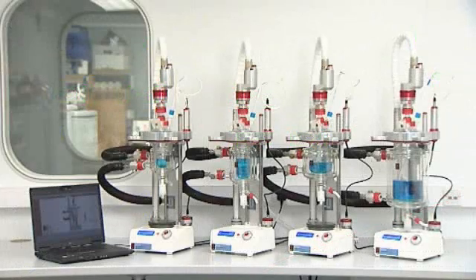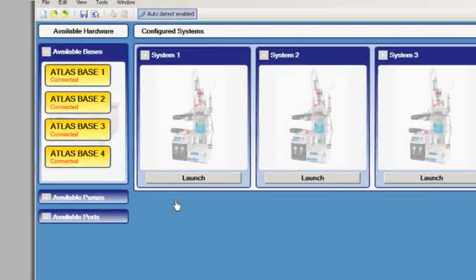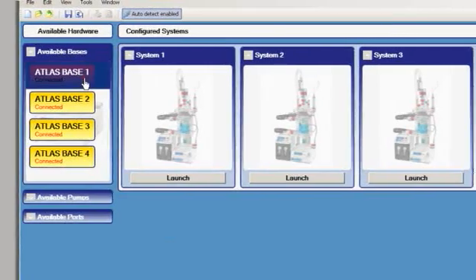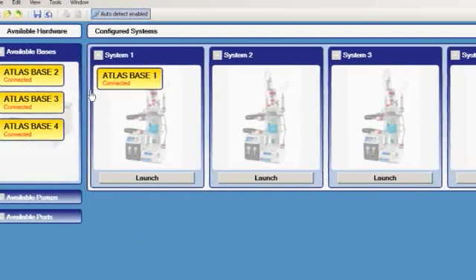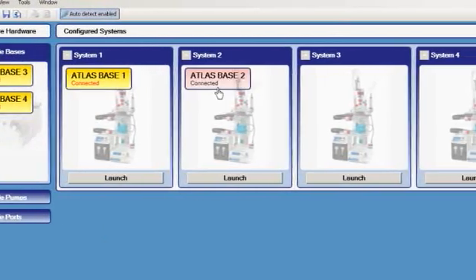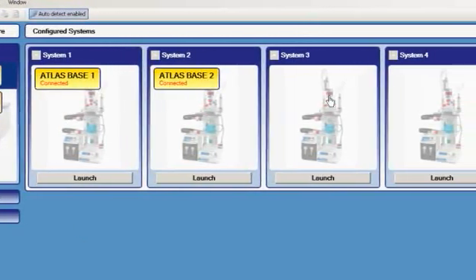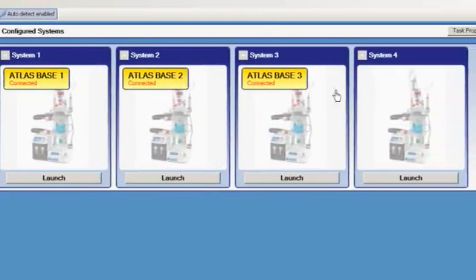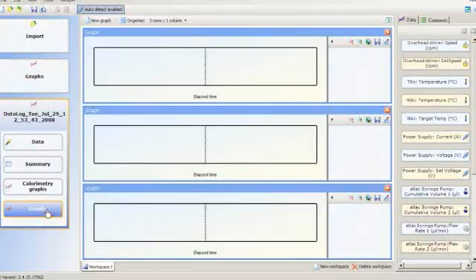The ATLAS parallel software allows many systems to be controlled in parallel or entirely independently, allowing a full design of experiment to be performed. Each piece of hardware is assigned to a system which can then be individually controlled.